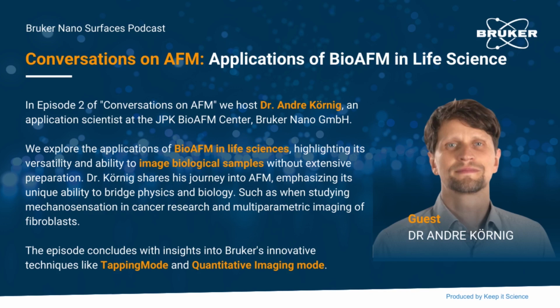This is a development that, when I started with AFM, was not possible or imaginable: that you can speed it up so much. Which, again, maybe not on the bacteria, but things can move around quicker and you can still see what they are doing. So this is quite nice, as it opens up a field of dynamics.